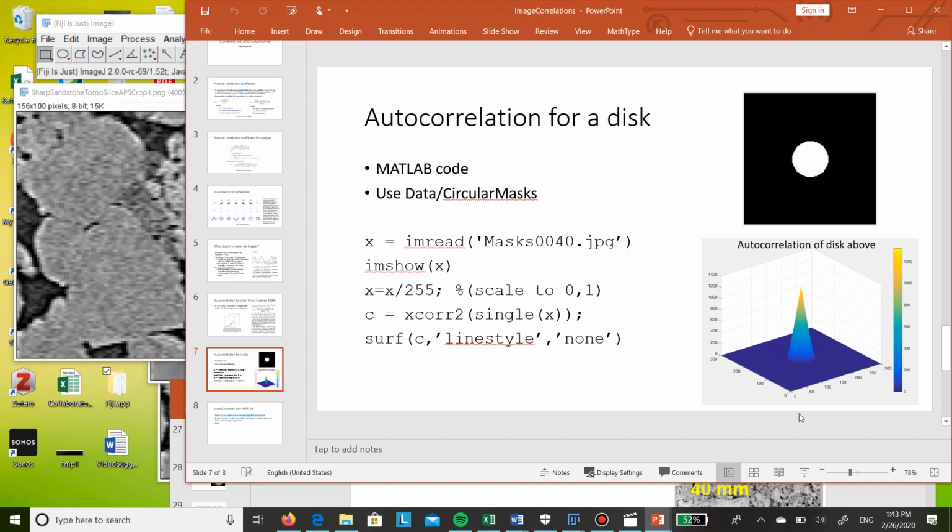So if you have multiple changes and things are changing in the image, differences are more telling than the absolute values. And that's common in X-ray. You're kind of playing within the same set of values. So you initially had a very good contrast between two phases, and you introduce a third phase that is somewhere in between. You're going to blur the contrast between the two. Pairwise, you might not have as good of a contrast anymore. So that contrast will show up better if you're looking at the differences between the original images.